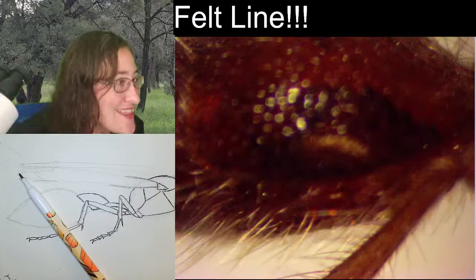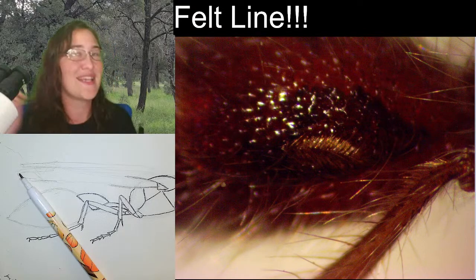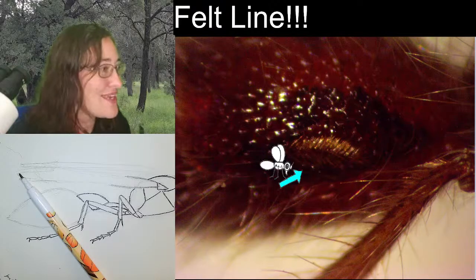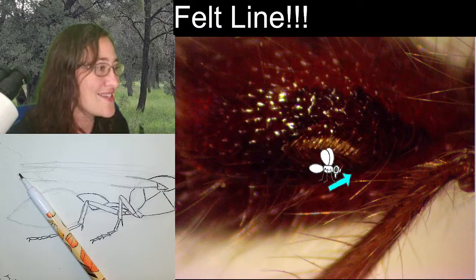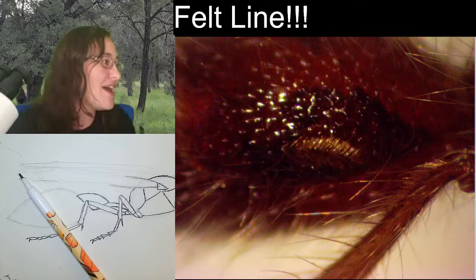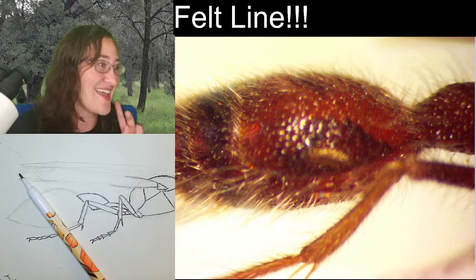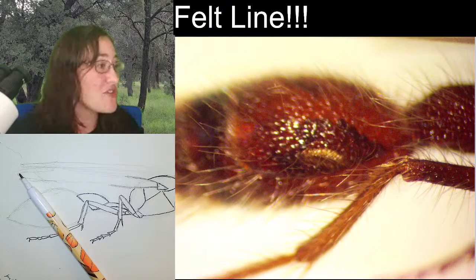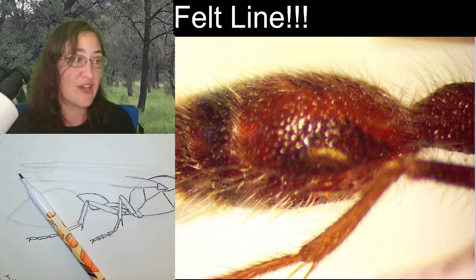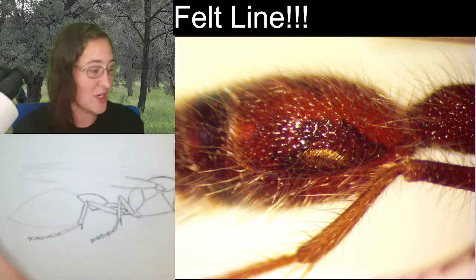and it's right there. It's really difficult to see when you have a velvet ant that is absolutely covered in hair. Sometimes you almost have to imagine that it's there. But on this specimen, it's so easy to say, hey, right there, that's a nice long line of short, thick hairs that we call the felt line. What the purpose of it is, I'm not exactly sure, but it exists, and that's how we know that it's a velvet ant. And there are other species and other families of wasps that can look very similar to velvet ants, especially male velvet ants with wings. So when you see that line right there, you know you're working with a velvet ant. That's all.